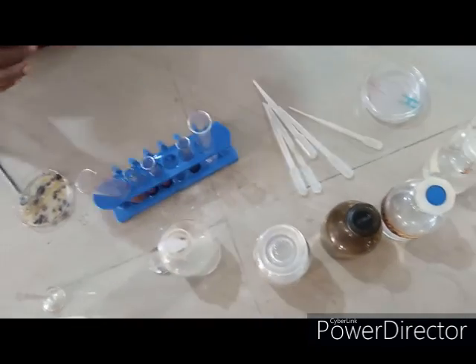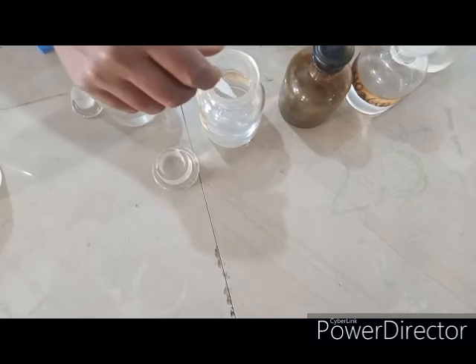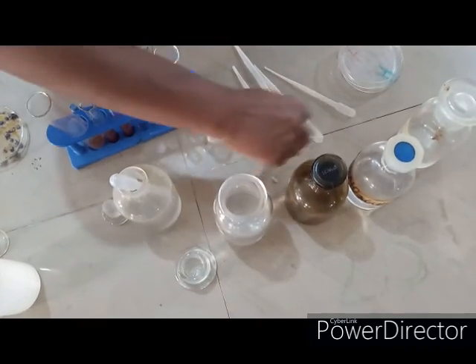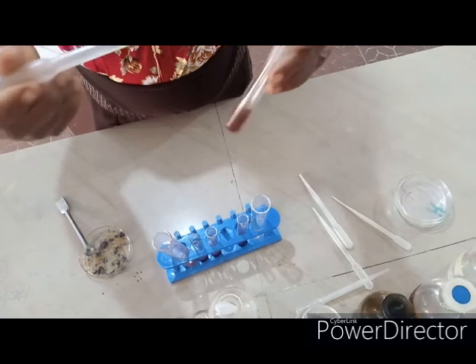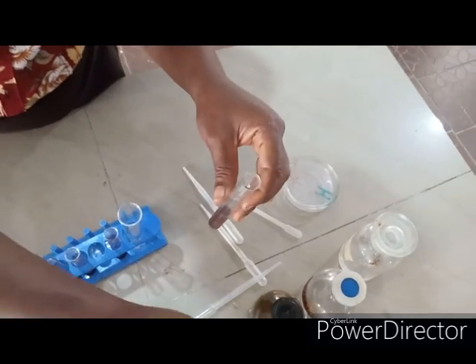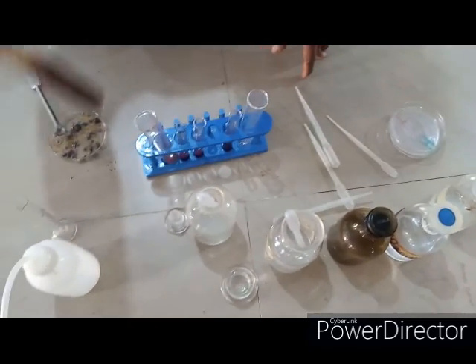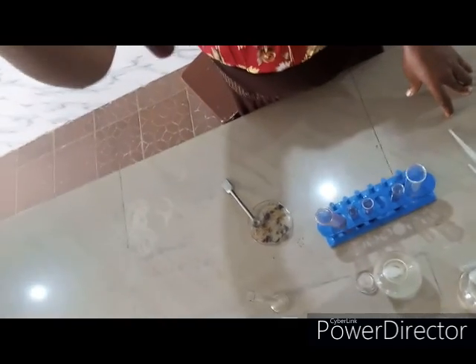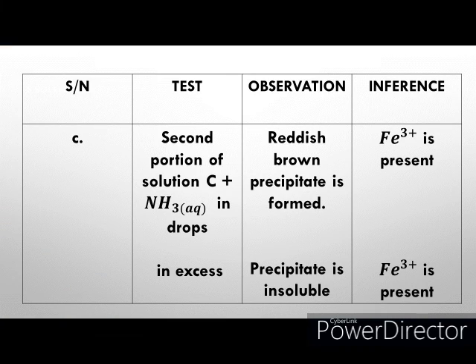To the second portion of the solution, we are going to add aqueous ammonia in drops and then in excess using your dropping pipettes. The same way, we observe a reddish brown gelatinous precipitate. Add aqueous ammonia in excess — the precipitate is insoluble. As you can see, the reddish brown solid remains in the solution. So iron 3 plus has been confirmed.